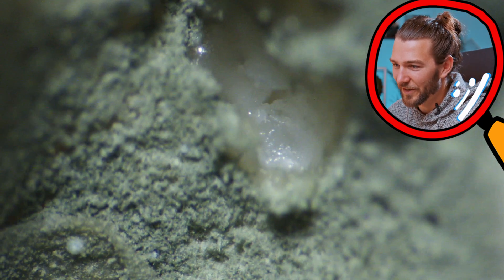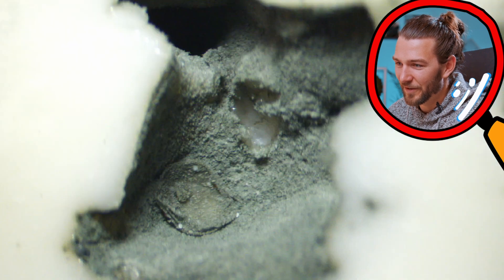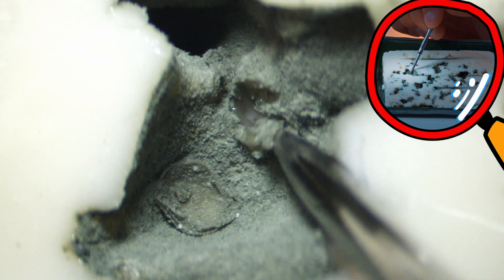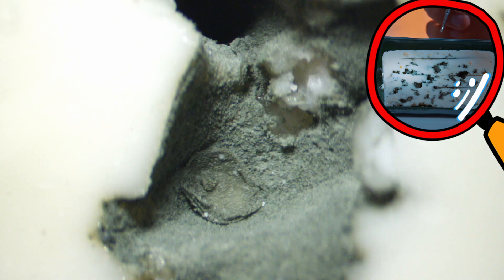You can see in reference to the low magnification how it looks like. Oh, it's very gooey and soft, a bit disgusting. But yeah, now you can see the mold. It's a very thin film and it's only on the surface.